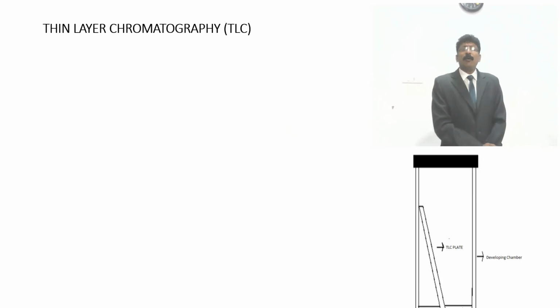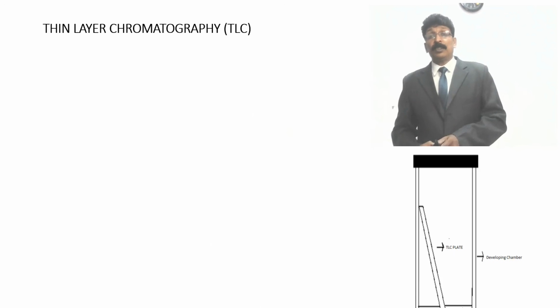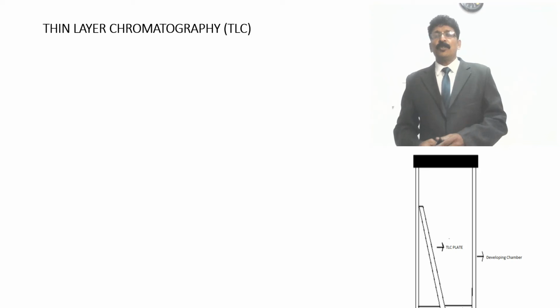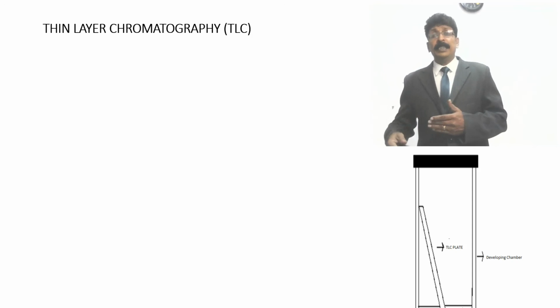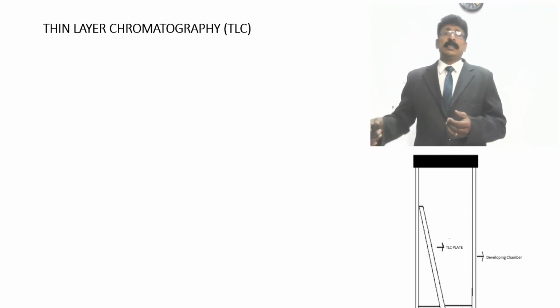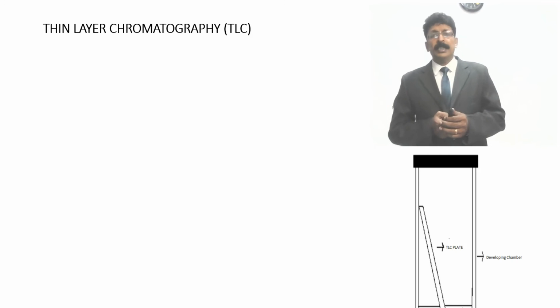Now we will have a discussion in the next class about thin layer chromatography, and this will be continued in the next class. So we have thin layer chromatography, paper chromatography, HPLC, HPTLC, and many classes are there. It will be compiled, and it should be studied very clearly for the separation of compounds.